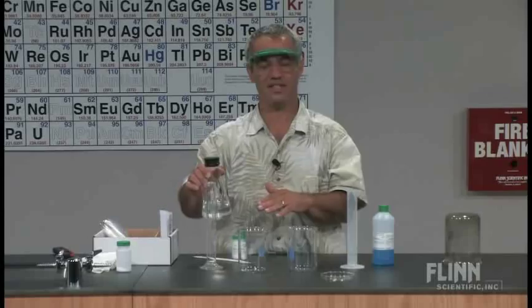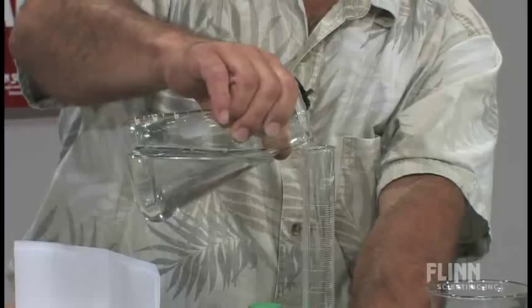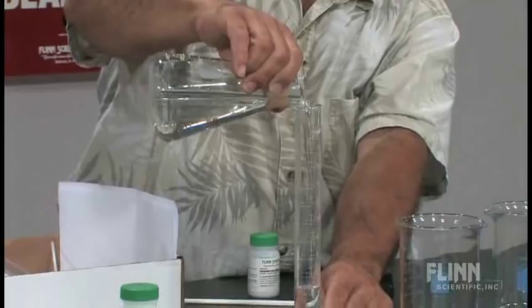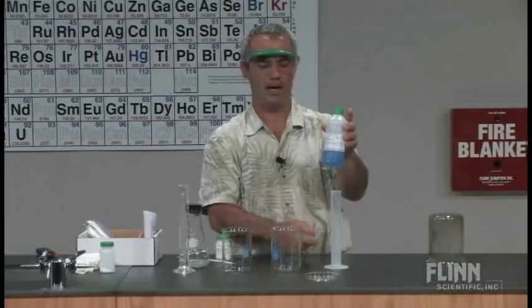It does need to be saturated or very near the saturation point for this demonstration to work well. And we're going to use about maybe 30 milliliters of that. Not very precise proportions, about three times as much. This is just some ethyl alcohol. I put some blue food coloring in there just so you can distinguish the two. And we're going to use about three times as much, so that'd be about 90 milliliters.